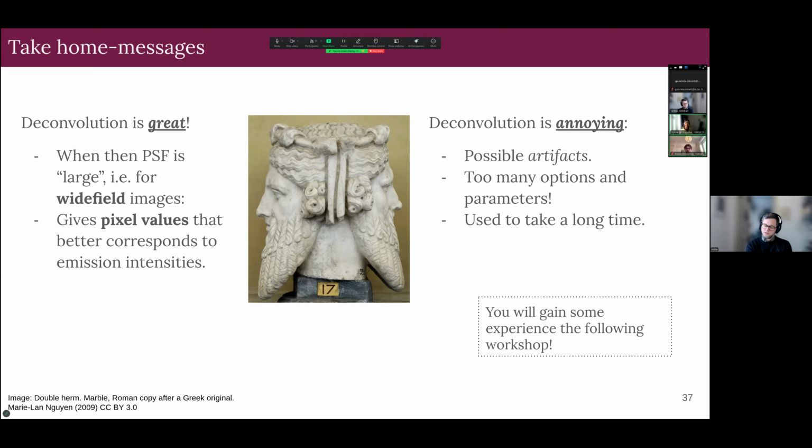There are many options, and although many of them share similar grounds, there are many options, mostly to incorporate a priori knowledge about the homogeneity of the samples, for example, and to handle different noise sources.